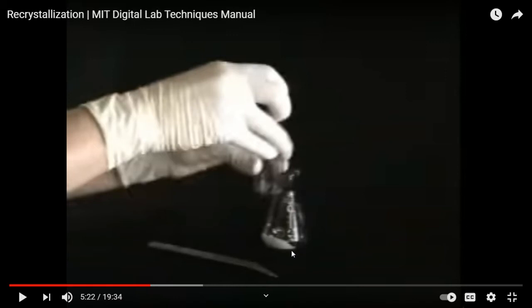Okay? Some Korean ramen, when they cook, you have to save some liquid. Otherwise, you're not gonna get a proper outcome. If you know how to cook ramen, you will save some. Same thing. You have to save a little bit of impure crystal before you dissolve everything.